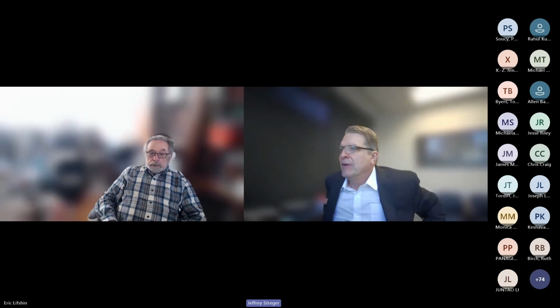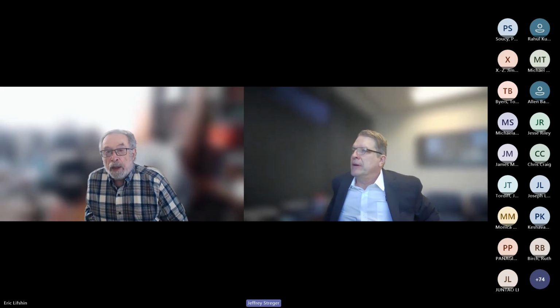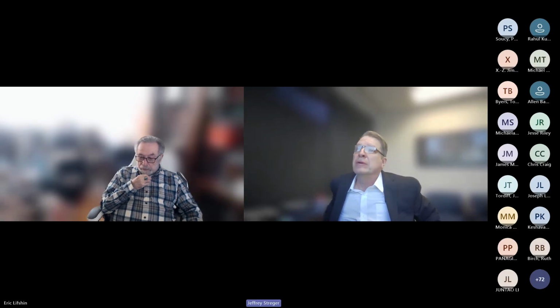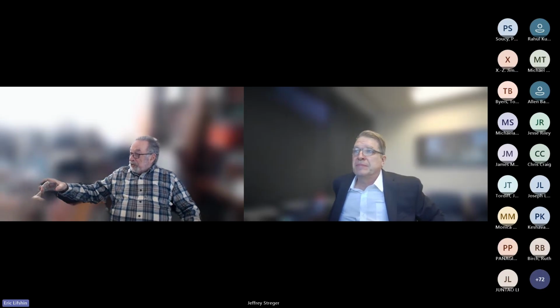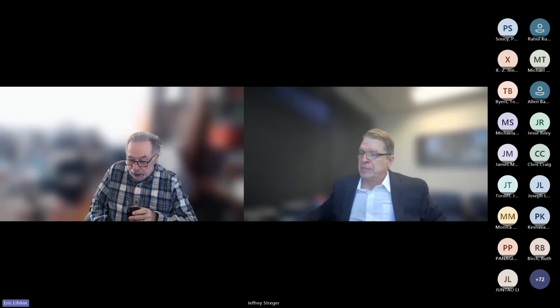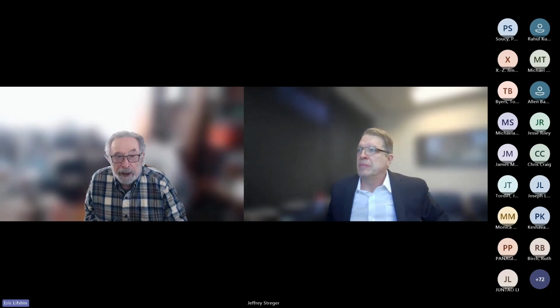Appreciate that. We have a few questions. Tony Bragg asks, how does dead time affect signal to noise ratio? Do you want more than 30%, less than 30%, but more than 0? You'd like to have typically less than 30%. Dead time is not your friend.